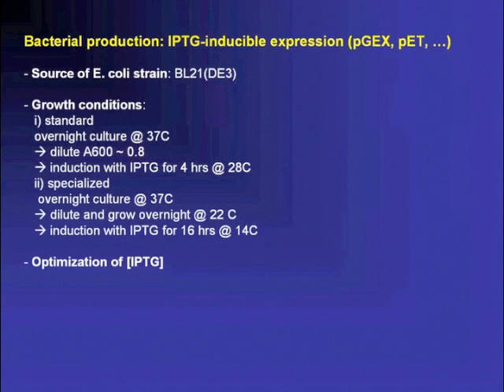One might try. Forgive my ignorance, but I've not worked with yeast, though I know people used to work with yeast because you can export your expressed protein in that, can you? Oh, okay. I remember well, there are possibilities in mammalian cells and so on to have secreted sequences, and then of course that might be an option. Okay, so coming back to the gene synthesis, we've had a question. How difficult was it to obtain the mutants, the single mutants?